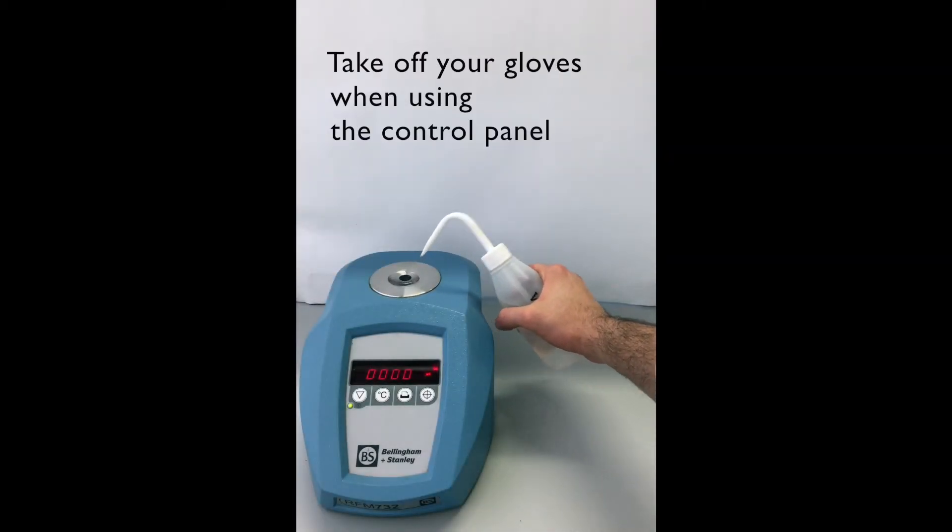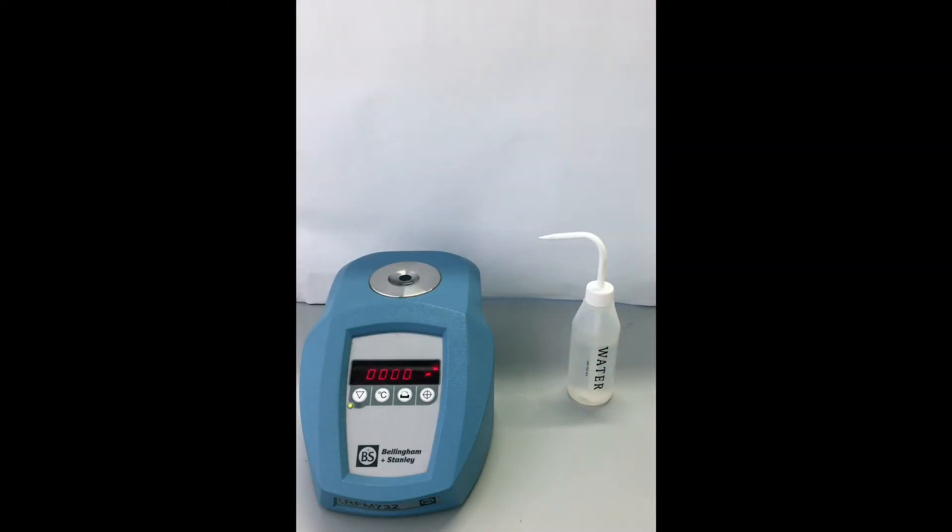Firstly, add some distilled water to the measuring prism and press the read key. 1.33300U1SC should show up in the display. Be sure to do this before you take your sample measurements.